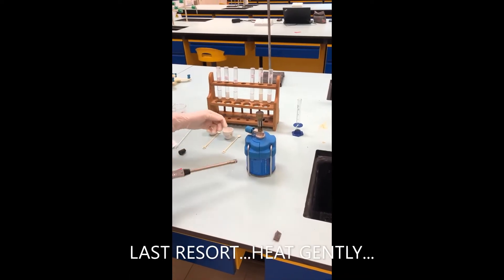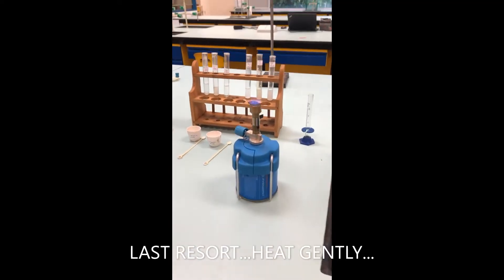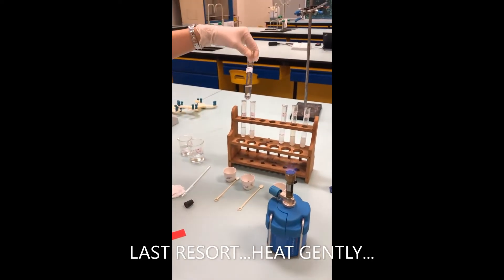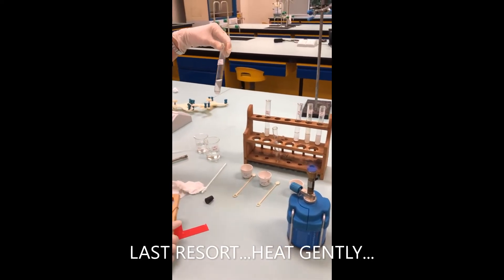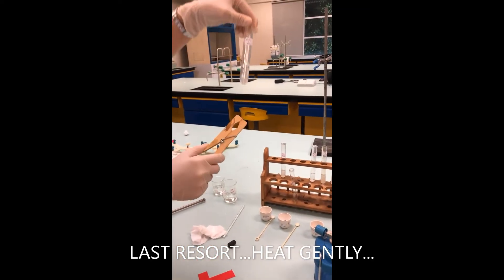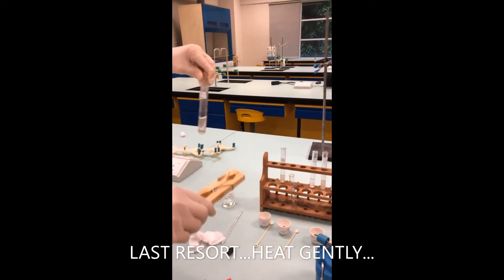Last resort — let's heat it up. Can you see the blue flame? It's very hot, so be careful. I'm not going to heat the magnesium oxide and acid because it has already dissolved beautifully. I want to check the aluminum oxide and nitric acid — we have some clear solution but there's still some leftover solid, so probably some of it has already dissolved. Let's see if we can dissolve more with heat.